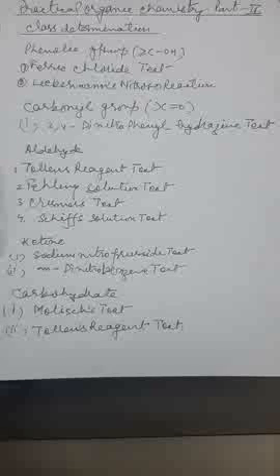Type 5 compounds contain carbon, hydrogen, nitrogen and halogens with or without oxygen. Type 6 compounds contain nitrogen and sulfur. Type 7 compounds contain nitrogen and halogen, and nitrogen and sulfur. So this is the classification of the class determination. Today we will discuss phenolic OH, aldehyde, ketone, etc.